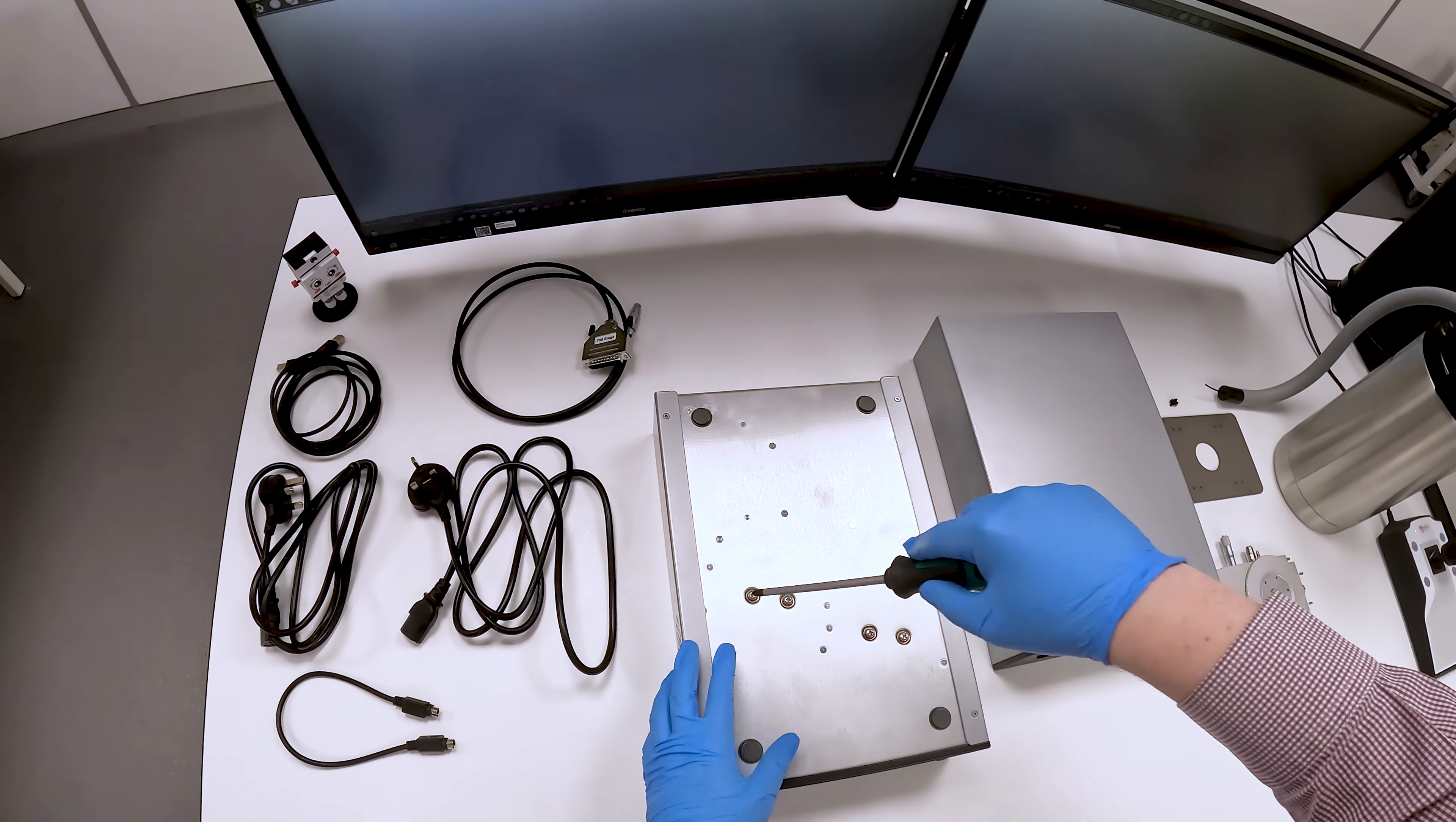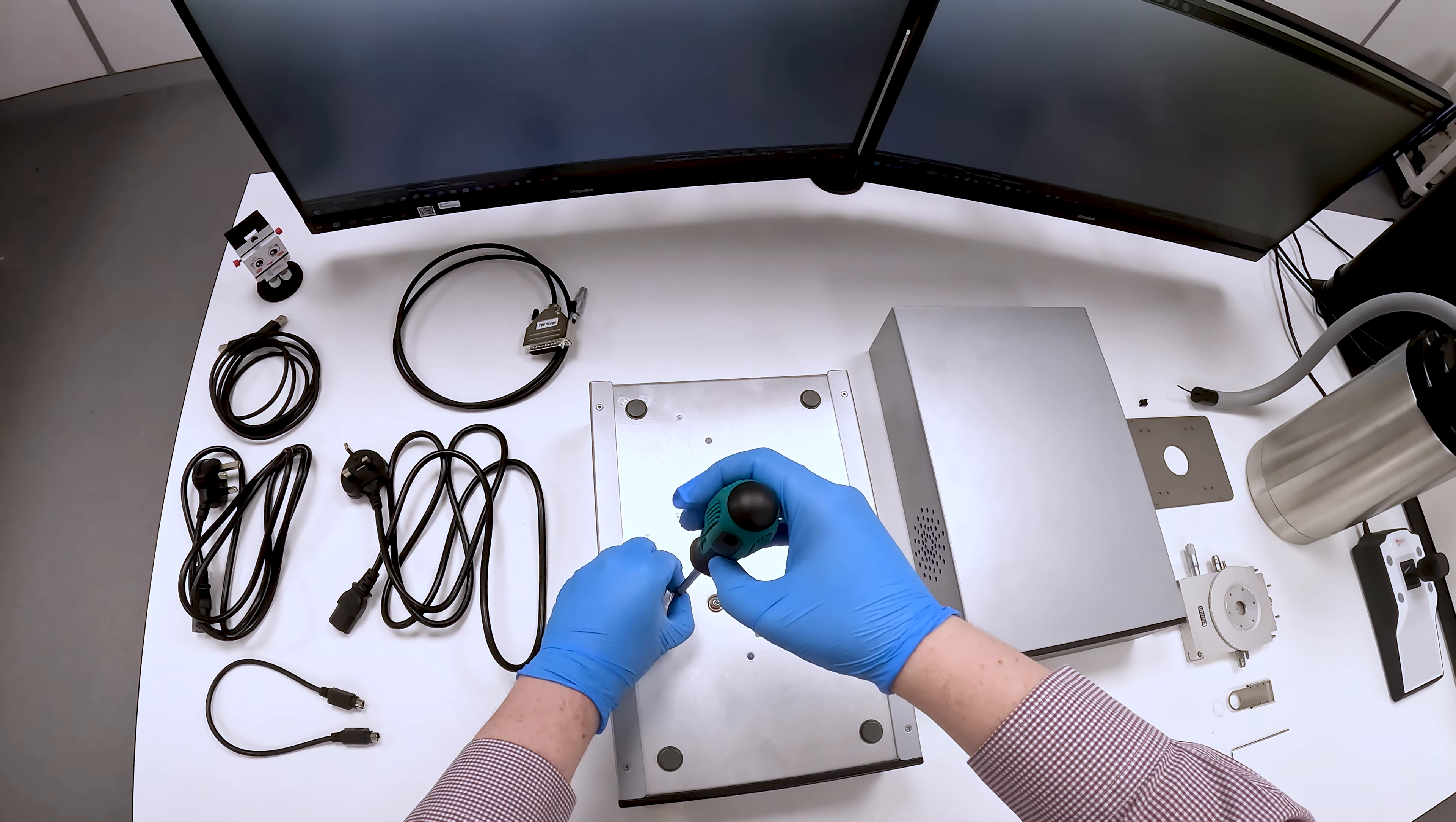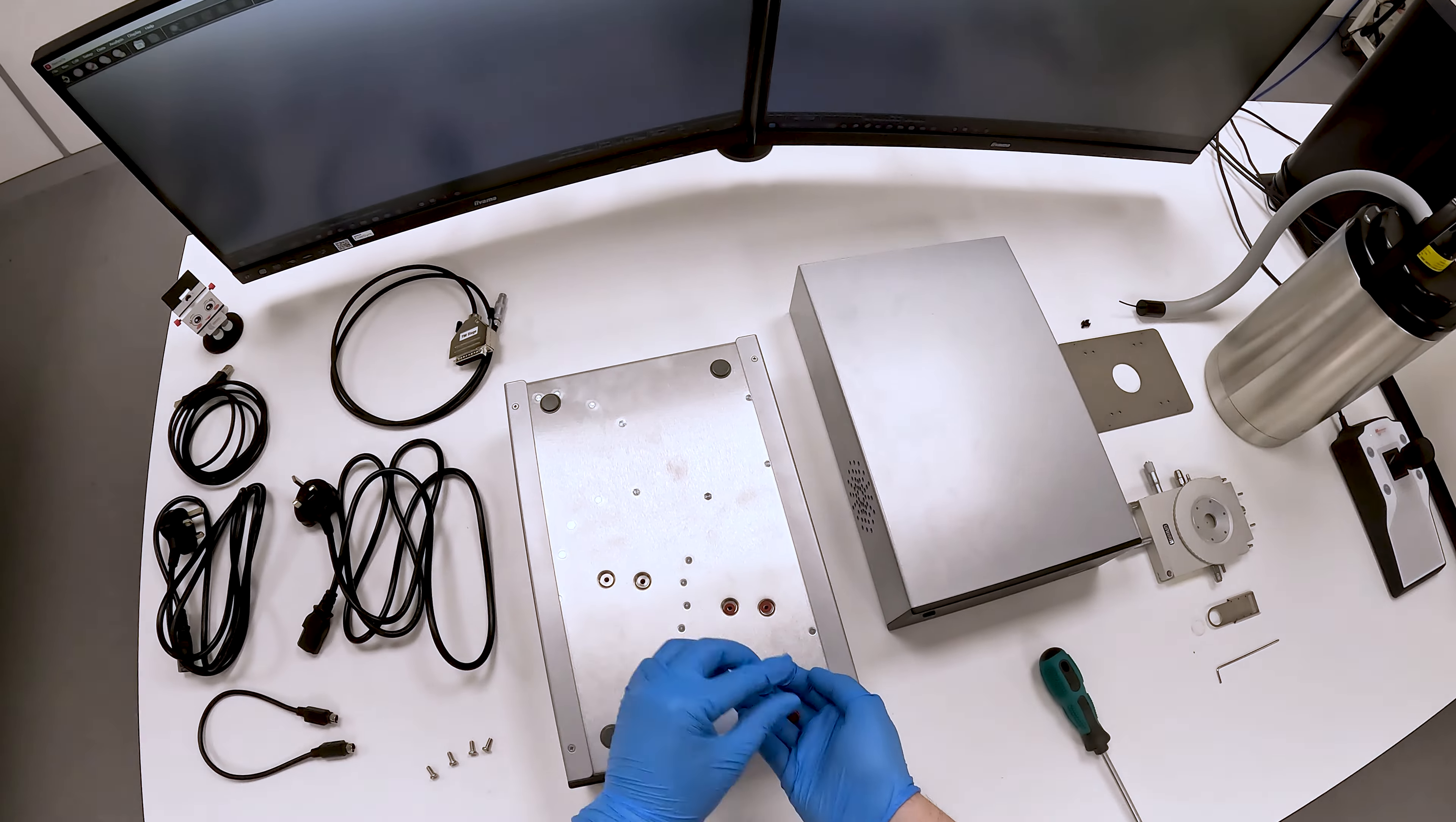First remove the transit screws from the base of the LNP96 liquid nitrogen pump unit. The transit screws should be stored and put back in the base of the unit if it is transported again. Then place the LNP96 on top of the T96.